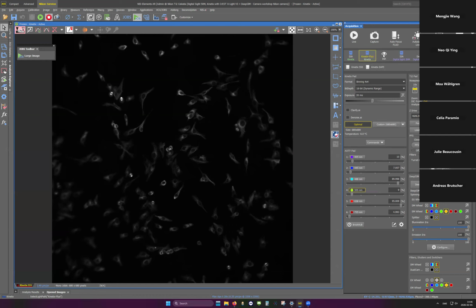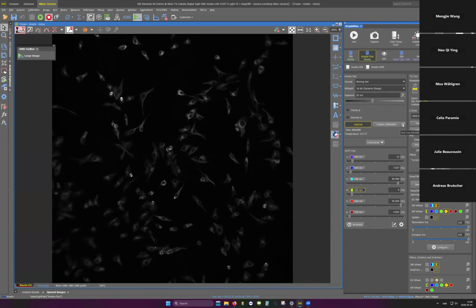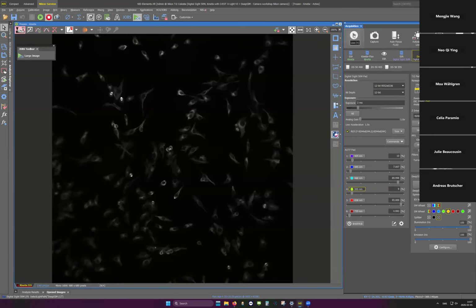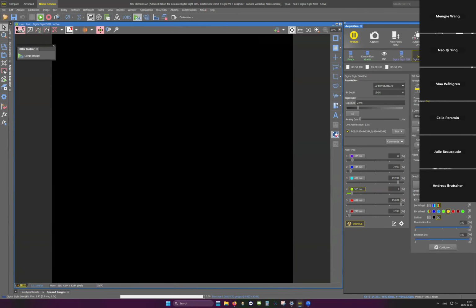Now I think we will need to restart the camera. Something went wrong there. But basically, this was the idea with the extra magnification lens. To be at Nyquist on a camera-based system, the magnification matters for the digital resolution. I think you might want to restart NIS.